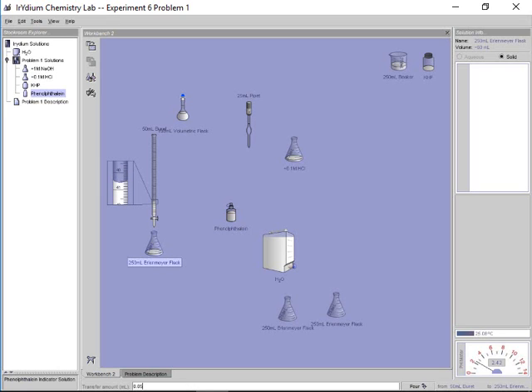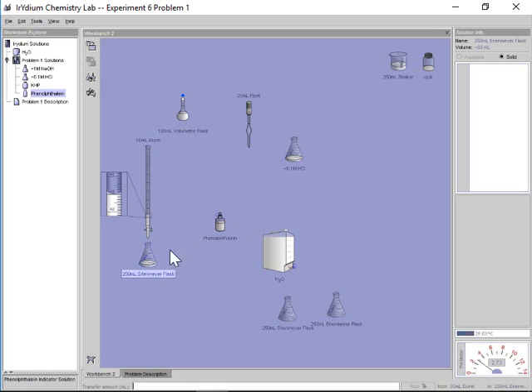The total volume is actually increasing there. Kind of sitting at the edge of our seats here. I want to actually make sure I've added in my phenolphthalein. I can even add in a few other drops. I'm really hoping I did add in that phenolphthalein. So phenolphthalein. Right. Oh, so it's guaranteed. Yeah, it should be turning pink if it turned to base. So that's just confirming that.